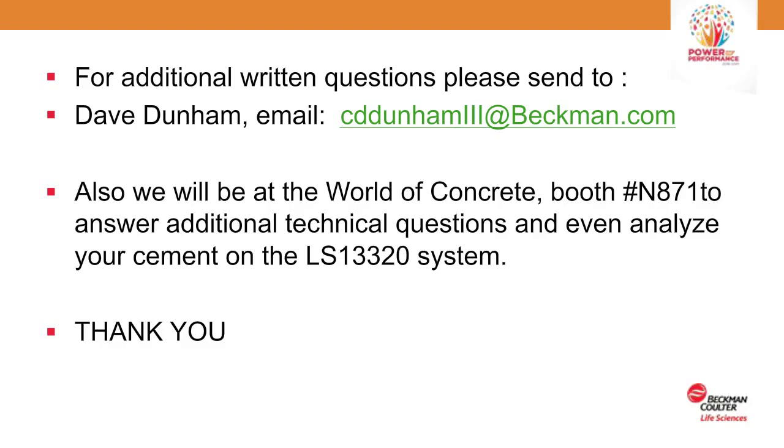And the computer controls the speed of filling and draining, and this operation takes about a minute and a half between samples to actually rinse the module and then fill it with clean fluid, so you're ready to add another sample and run another sample. But it's quite automatic.